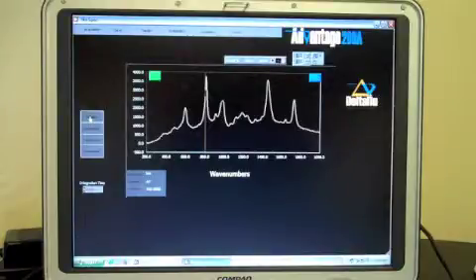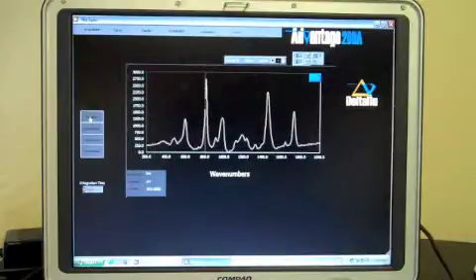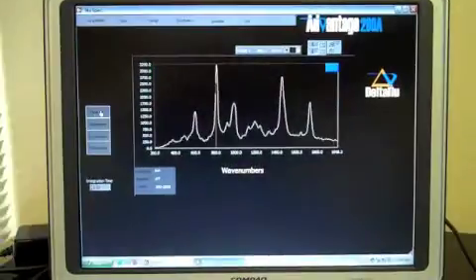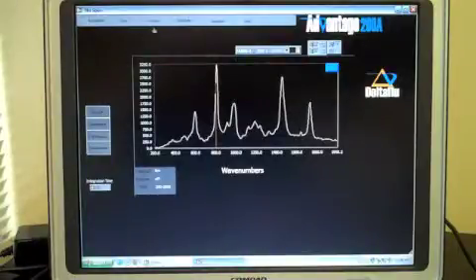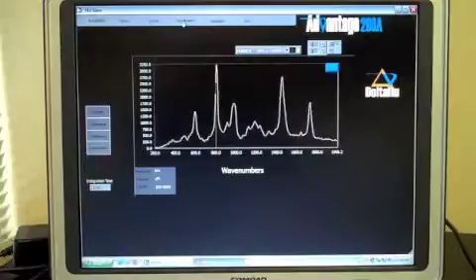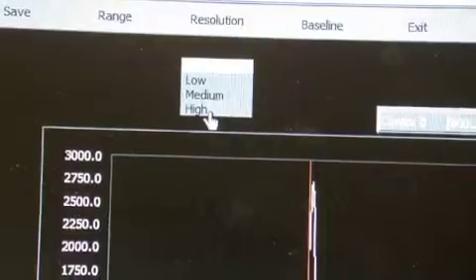To get the best precision for assigning peaks, choose High under the resolution menu bar at the top of the screen.